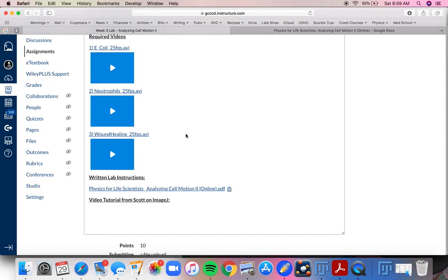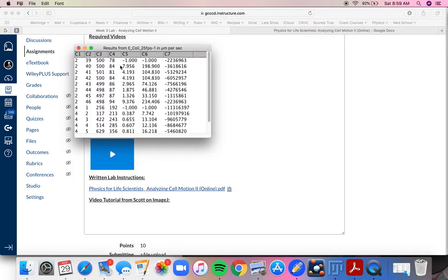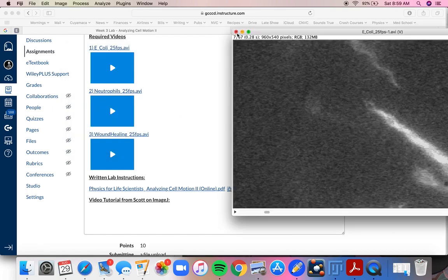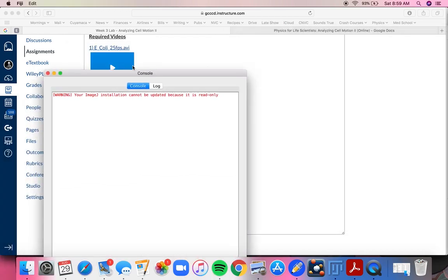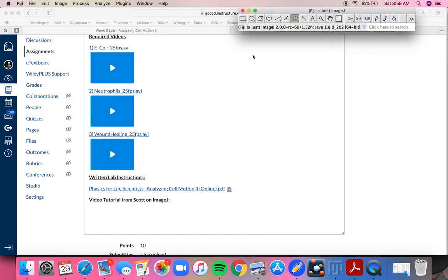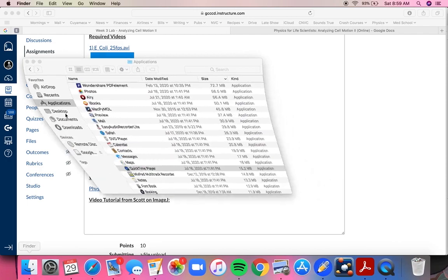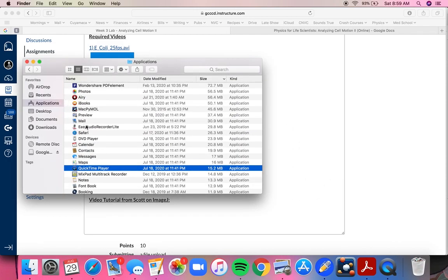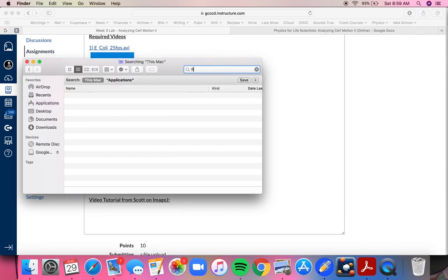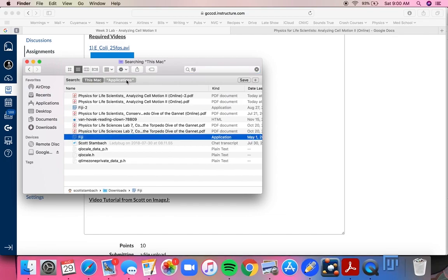Okay. Once you have Fiji open, this is what you should see. Actually, you shouldn't see that quite yet. I'm going to close out the videos that I already had. Okay. So I'm going to go to my applications, right? And I'm going to find, well, I'll just go ahead and do a search. I'm going to put searching Fiji. And there it is. I open it up.